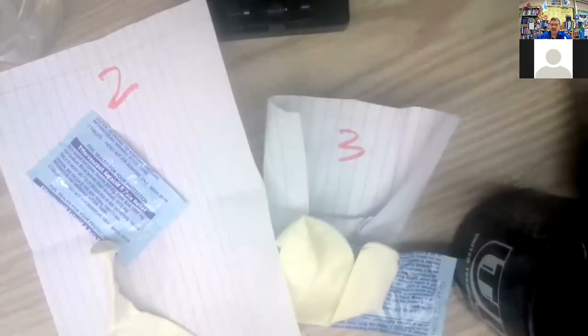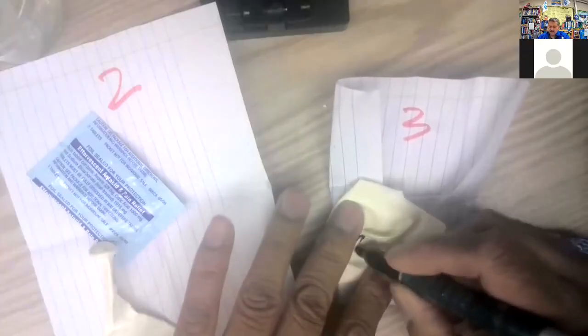2 on this one here. 2, 2. Put it in a couple different places like that. And then let's do the same thing for the third one. So here's the third one right there. So now I got my balloons all labeled. And now we can take the powder and put it in there.